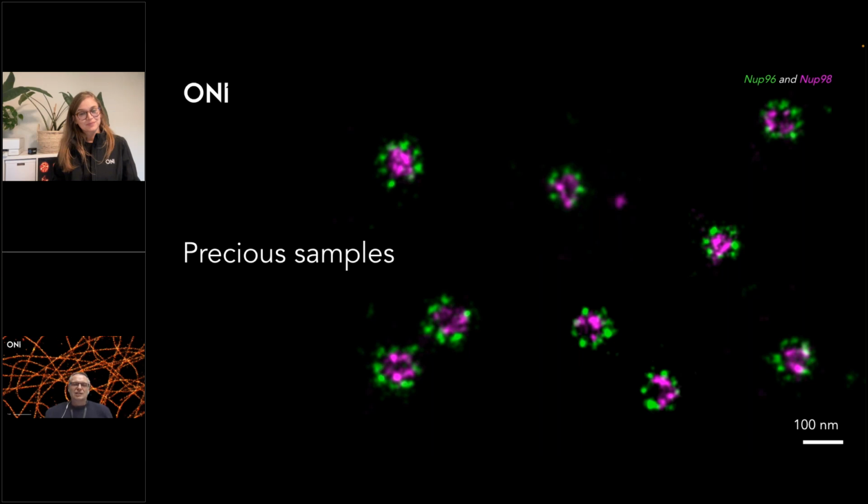I will actually just follow the same protocol you use for any of your other assays. The difference for dSTORM imaging, or even for confocal imaging, is just to make sure that your cells are adhered to the surface. And the best way, or a more non-invasive way in this case to adhere them, is using polylysine as a straightforward first approach. You can use any other extracellular matrices if you want, but I would not really change the way of preparation yourself.